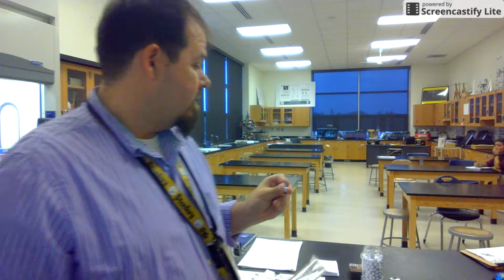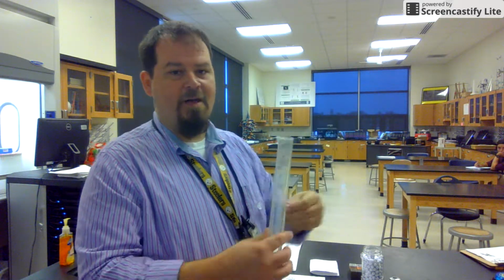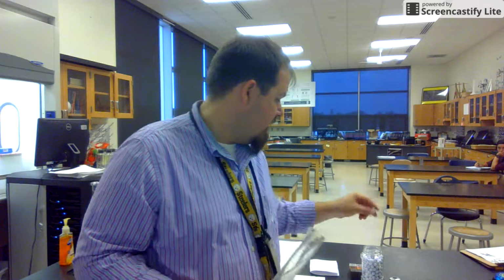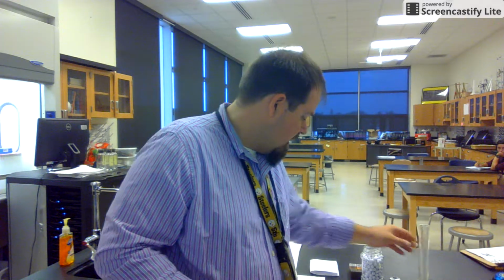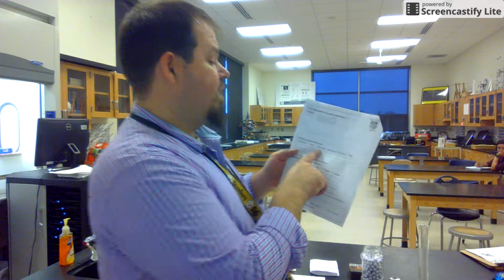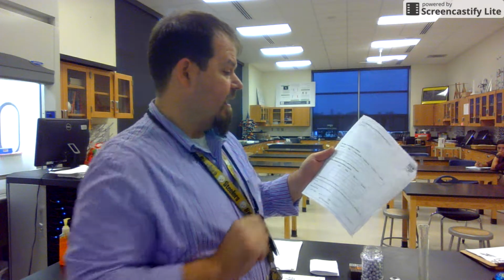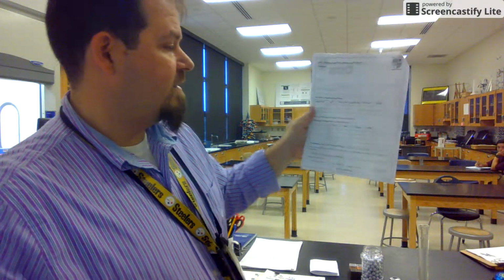In this particular case, though, while they're dry, see if you're going to be able to watch this backwards. Mass it first. Mass it dry, then volume it, because then it's going to get wet. We don't want to put anything wet on the balance, okay? So then I'm going to have initial volume, final volume, total volume, and calculate my density, and we're good. And then the last part, part 3, is my unknown solid.